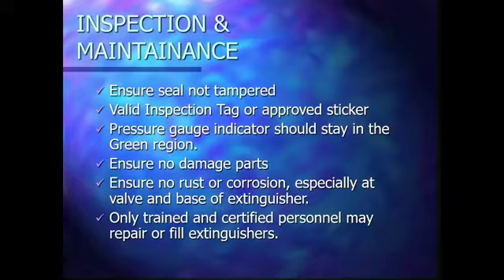You have to also ensure no rust or corrosion, especially at the valve and the base of the fire extinguisher. This is again a very significant point, merely because it might cause other accident while using it.